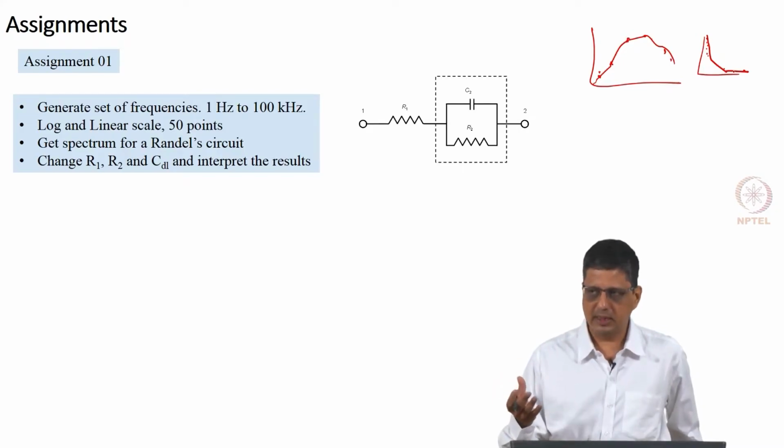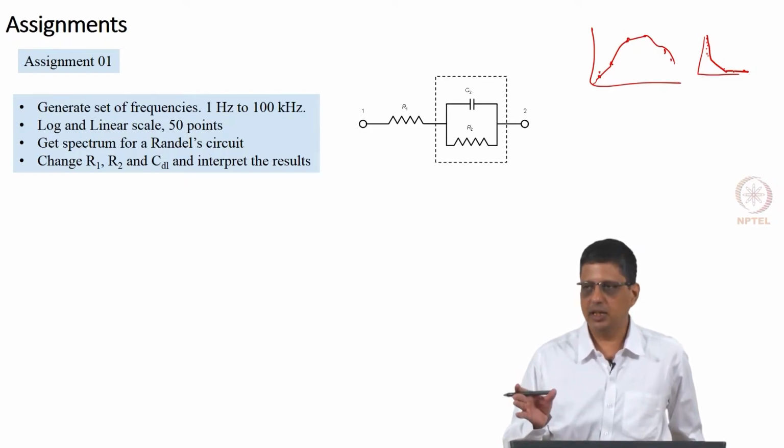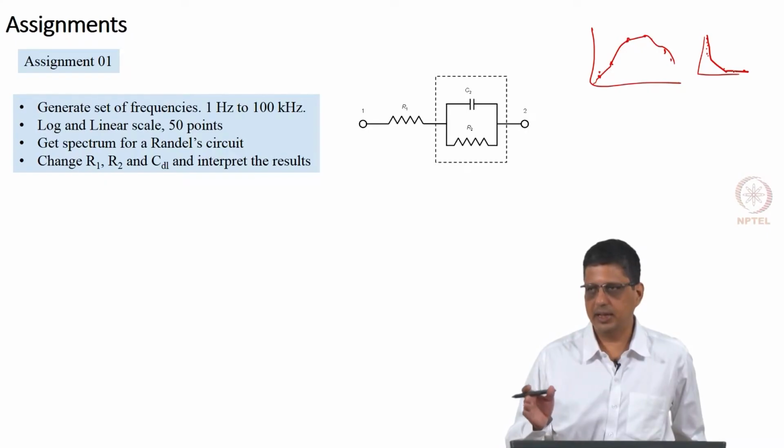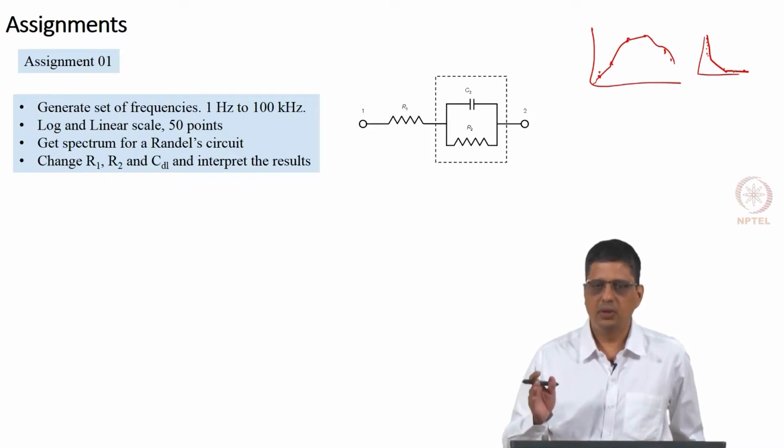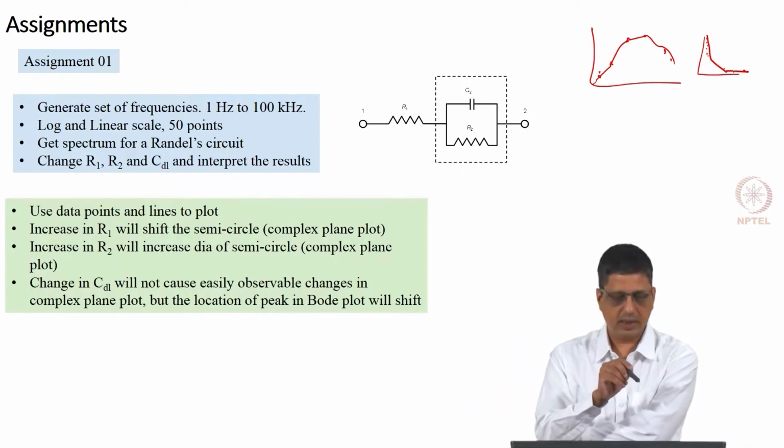Finally, how you present, once you realize what is happening, that is different. If you are looking at data, you should know where the data lies and how they are spaced, and then if you want to emphasize certain points, you will present it. The first time, it is better to put data points and lines, markers and lines.